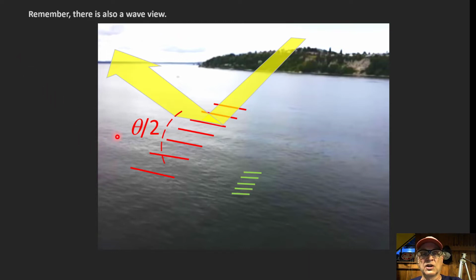And you can see it's sending off bow waves that are going to go here. And actually those travel a long way over to the shore. If you ever sat on the shore when a ship went by, you notice that the waves do propagate a long way. But anyway, light that was reflected off of those waves would fluctuate at a different speed than it does at high Q. Believe it or not, that's kind of related to Fick's law of diffusion.